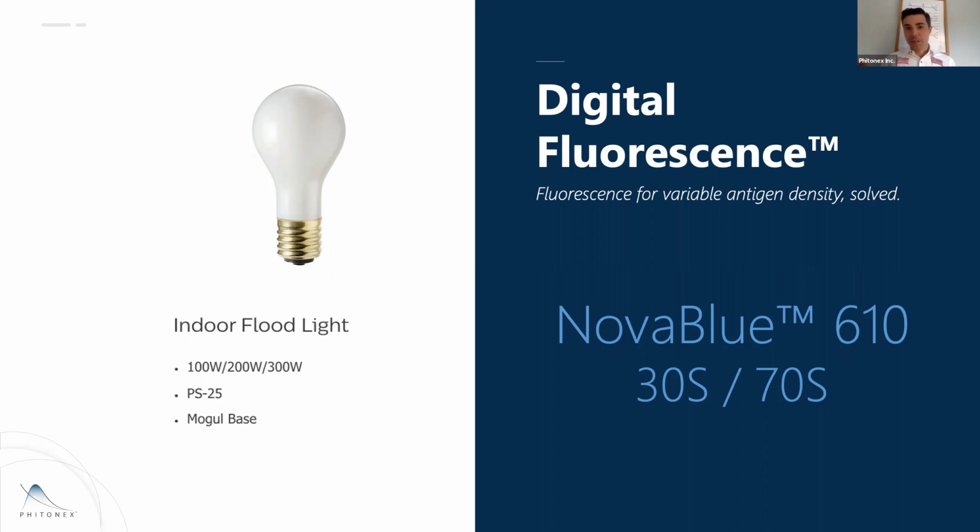There's no naming conventions for brightness when you can tune the brightness of something, right? Because it's just like, here's PE, deal with it, right? Or here's APC, and there's your brightness chart. Good luck. And for us, what we ended up coming up with was, let's name these based on the separation indices on CD4 off in Aurora, right? And then let's just say that that's going to be the wattage of each one of these. And of course, separation indices are going to change, but it gives people a good idea of, okay, well, what are you talking about with respect to these brightness versions?